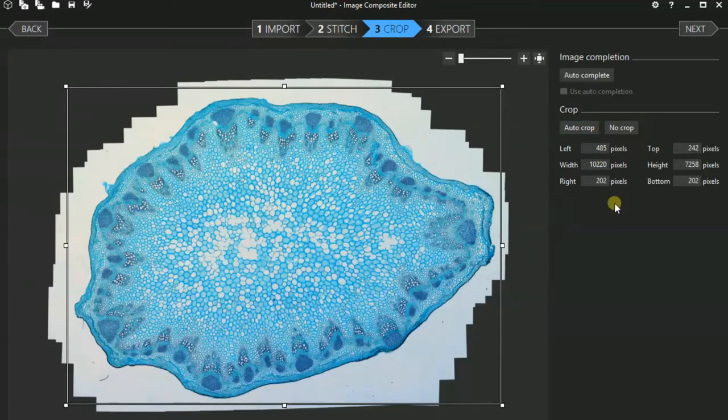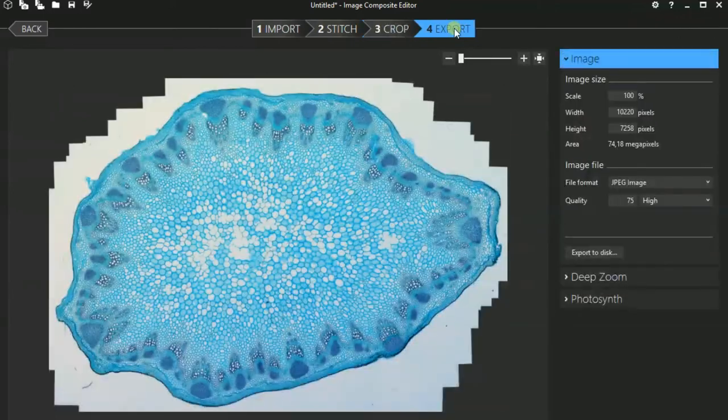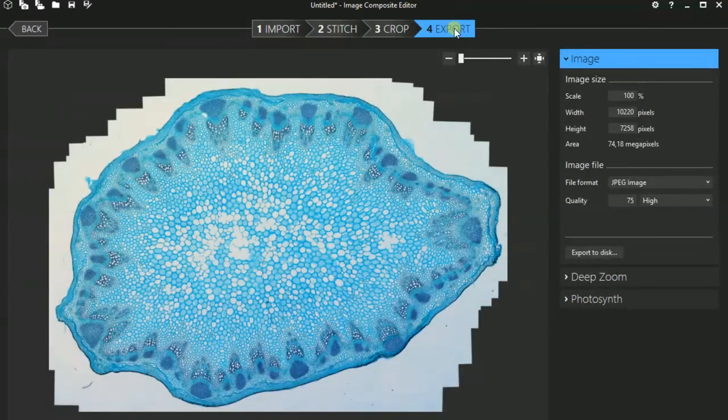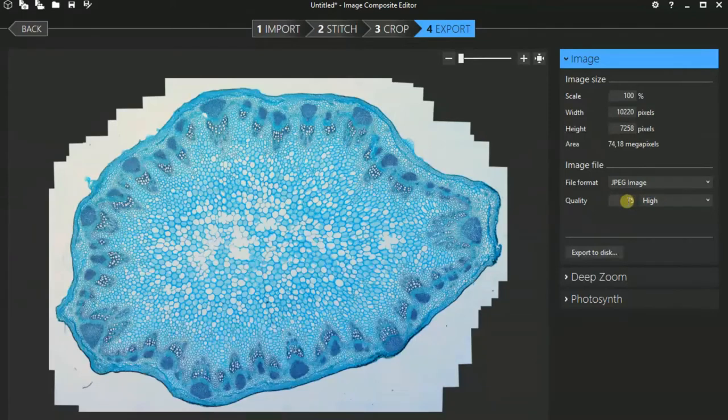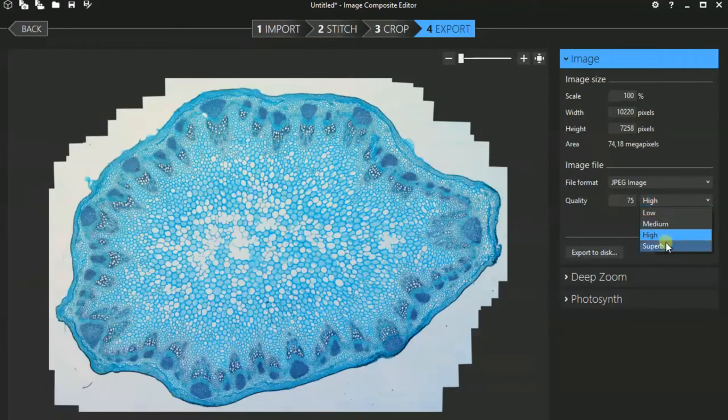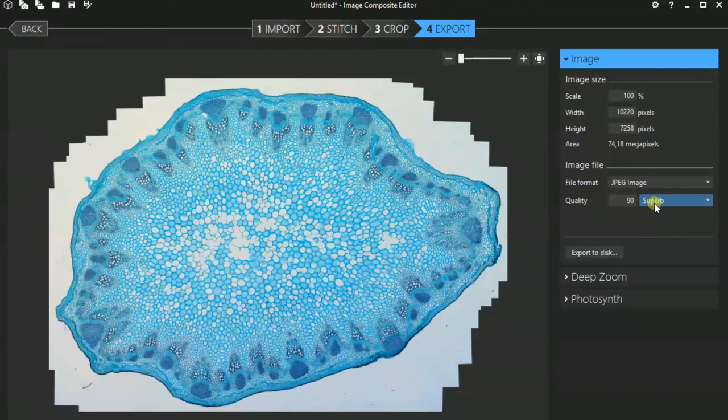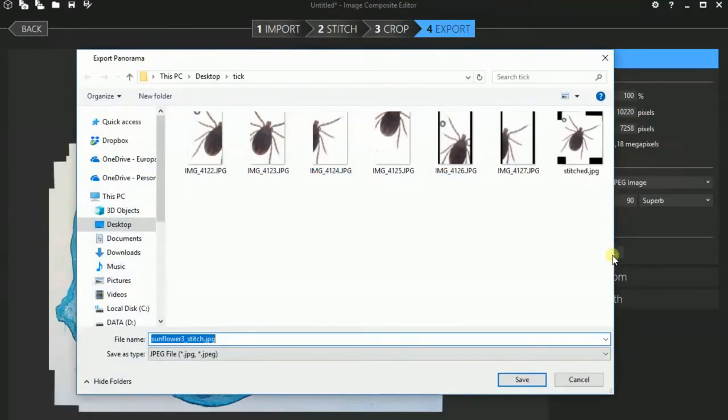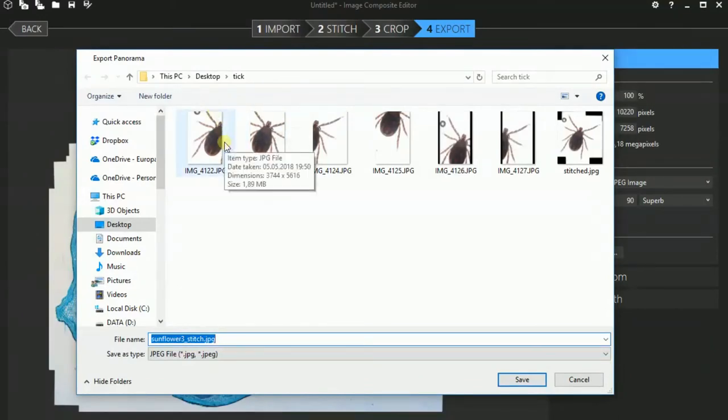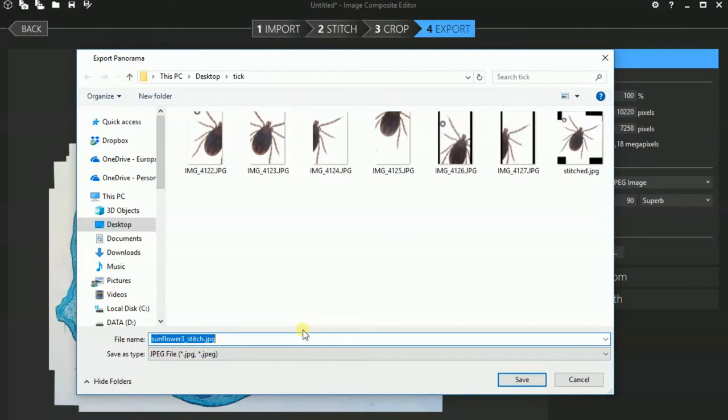And then I will again export the picture. I can now adjust the quality of the image. I want to have a superb quality because I'm going to be editing it again later. I have to type in a new file name just like before. I'm just going to save it now next to the images of the tick. And of course you want to give it a meaningful file name.